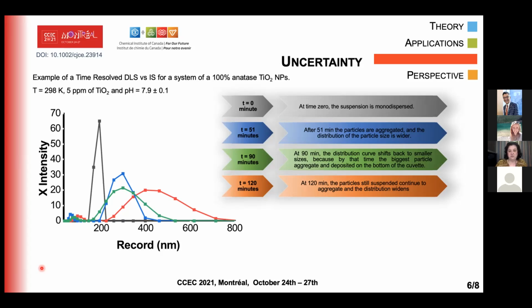So one of the consequences is that if you take a long time to take the measurements of the sample, maybe you won't get the same zeta potential because your sample is already not the same as before. So this is a good example to understand when the solution is stable in terms of long-term conditioning or use.